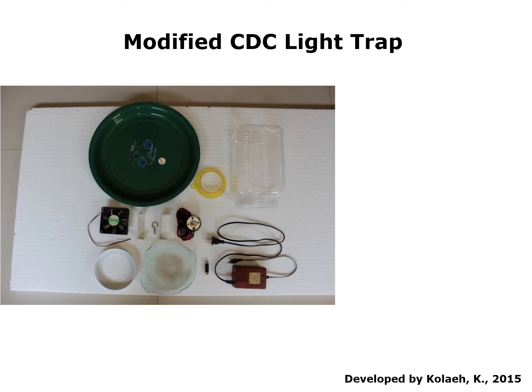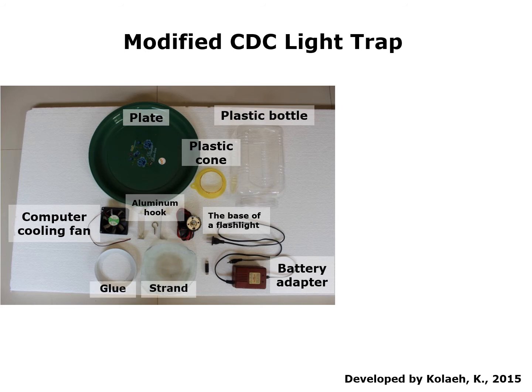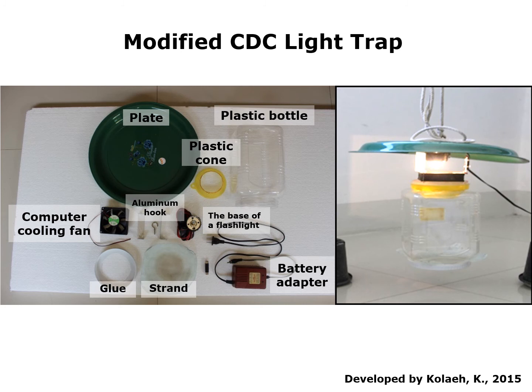The materials required consist of plate, plastic cone, plastic bottle, computer cooling fan, battery adapter, the base of a flashlight, aluminum hook, strand, and glue. The finished product looks like this. It is similar to the CDC Light Trap, and as you may notice, all of the materials are very cheap and could easily be obtained.